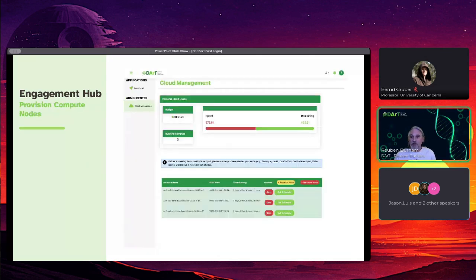The idea is that when you start the computing nodes, you use them and then you turn them off when you finish, so they're not consuming resources when you're idle. It is very easy to leave at the end of the day and forget to turn this off, or even leave it over the weekend and get a bit of a cost overrun. Ask me how I know.